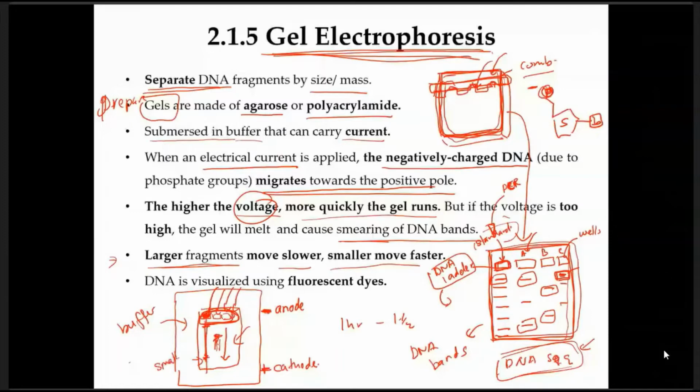Smaller the size of the fragment, the nearer the DNA band from the well, the size will be bigger. Tu awak kena ingat lah. Okay, so, sebab apa? Bila DNA fragment tu besar, dia susah nak lalu dalam gel ni, so pergerakan dia lambat. Okay, the smaller molecule can travel faster, so it will be further away from the well.